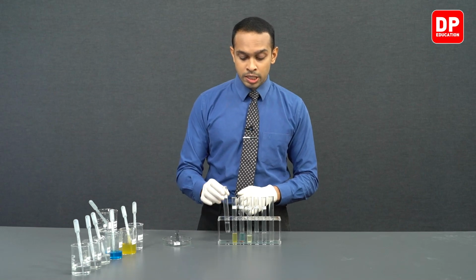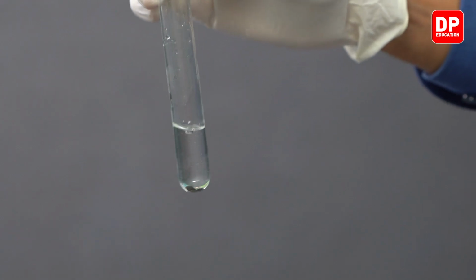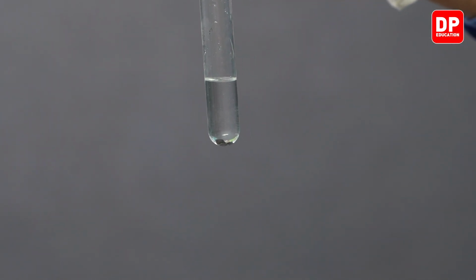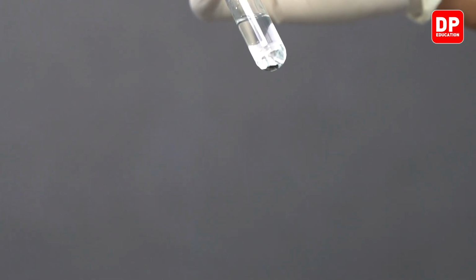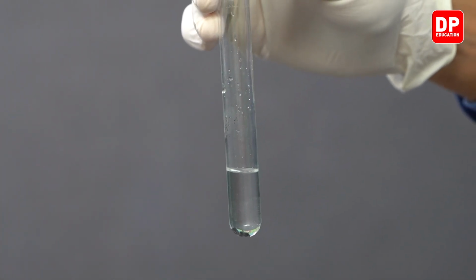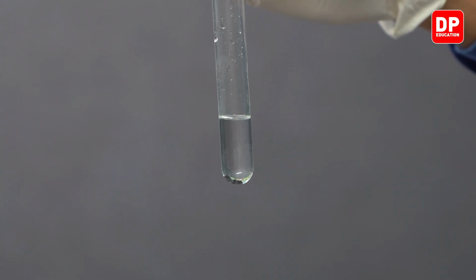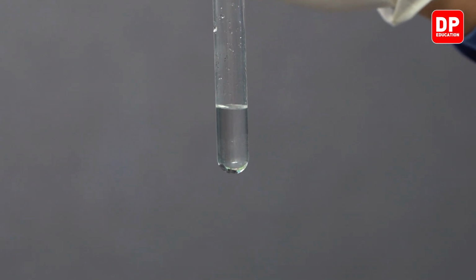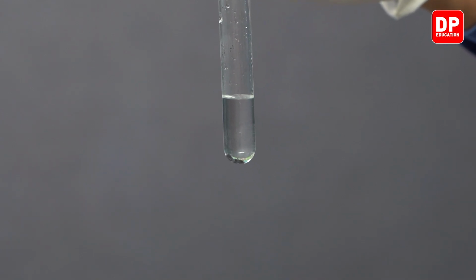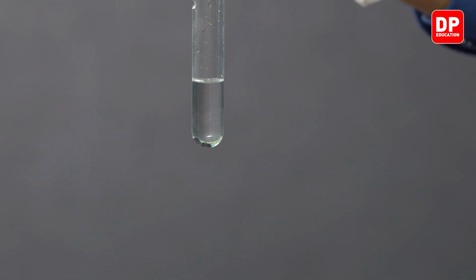So let's take our zinc 2 plus solution. We do not observe any color change or formation of any precipitate over here. The added metal piece is still at the bottom of the test tube without any reaction. So this indicates, students, that there has not been a reaction between Fe solid and zinc 2 plus aqueous ions.